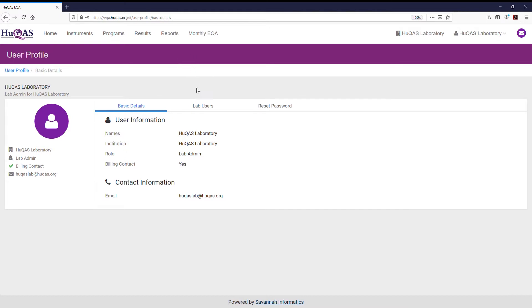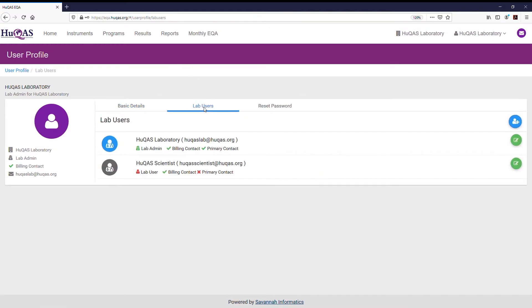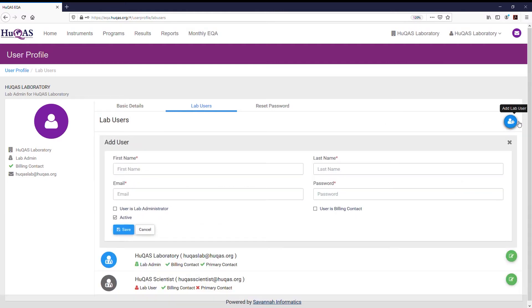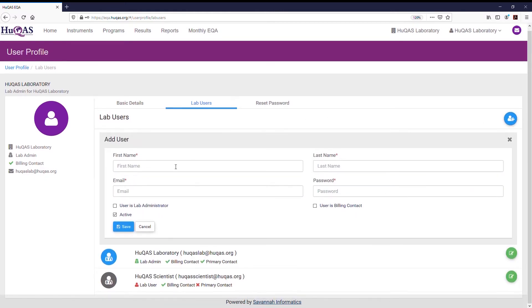To add a new user, select the blue circular button on the right to reveal a form. Fill the form appropriately, then save to complete the process.